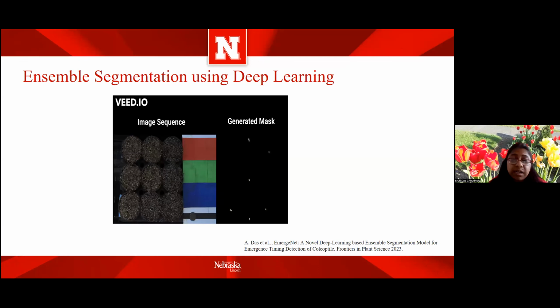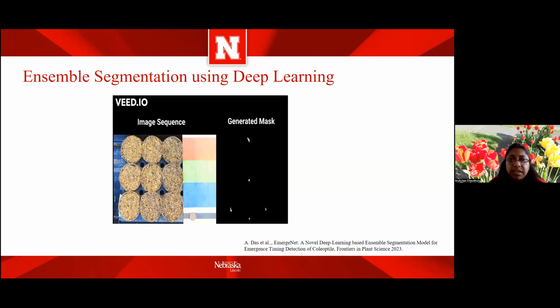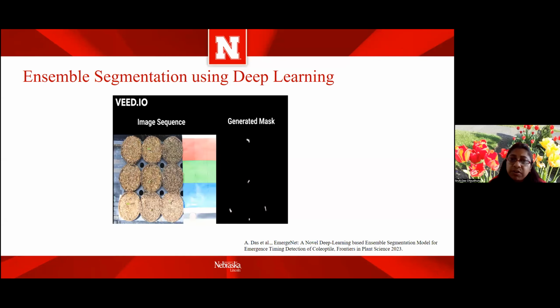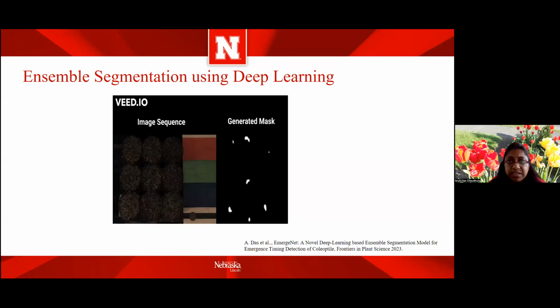Definitely, there are many powerful traditional segmentation techniques, including semi-automated ones, as I just demonstrated with graph cut and active contour. Those are really helpful segmentation techniques. Apart from that, we can do learning-based or deep neural network-based segmentation.